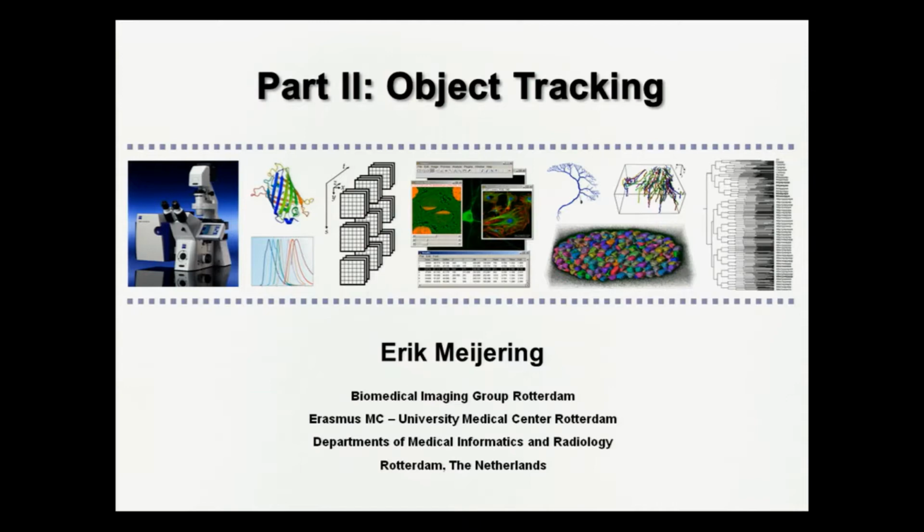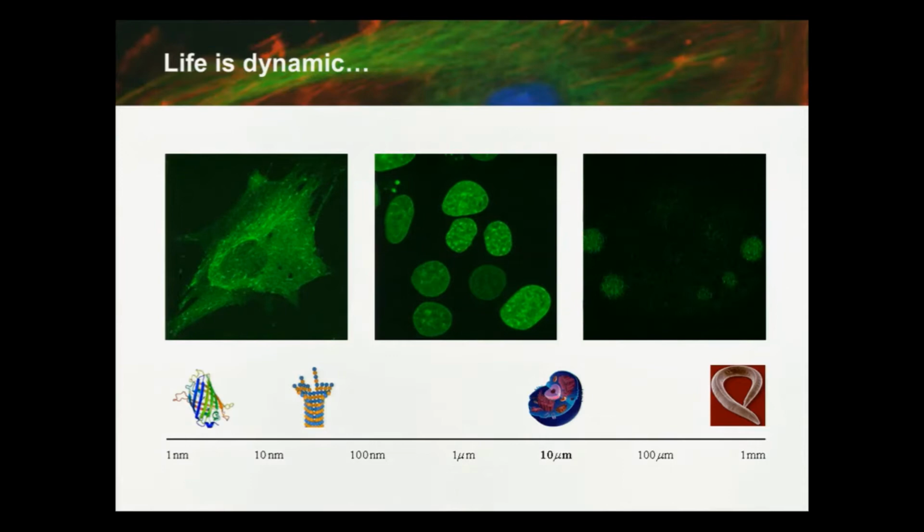So we talked about registration, image registration, making one image align or match with the other. This is like a global thing. But in many experiments, especially when your data is a time-lapse series, a movie, you're usually interested in not just global matching. Often that doesn't even make sense. You're interested in particular objects within the image that you want to detect and segment and follow over time in order to study their dynamics. So that's really a problem of tracking, and it's a more specific or more detailed question than just global image registration.